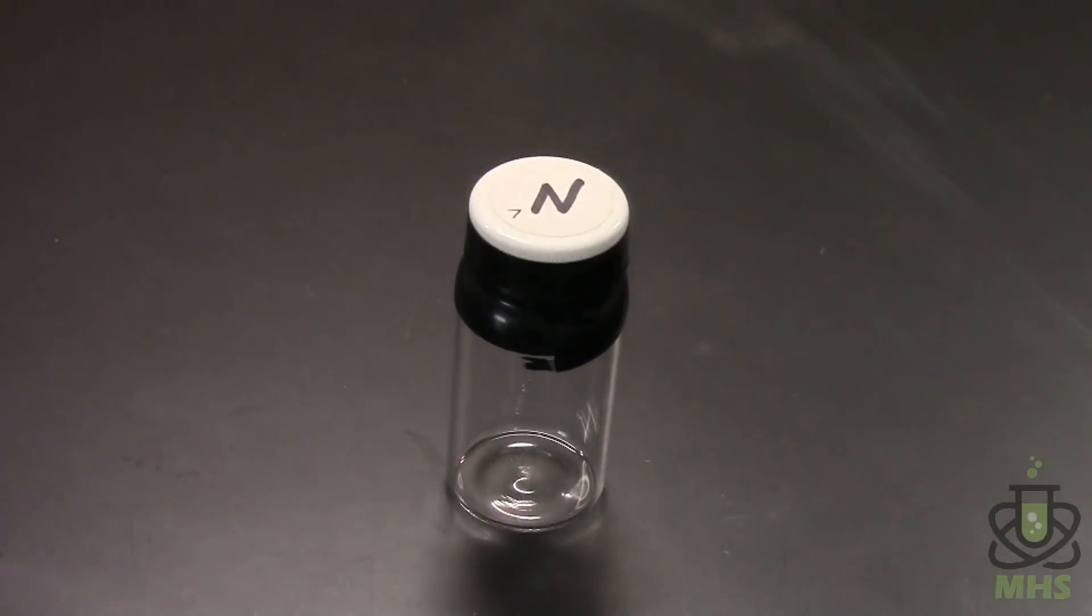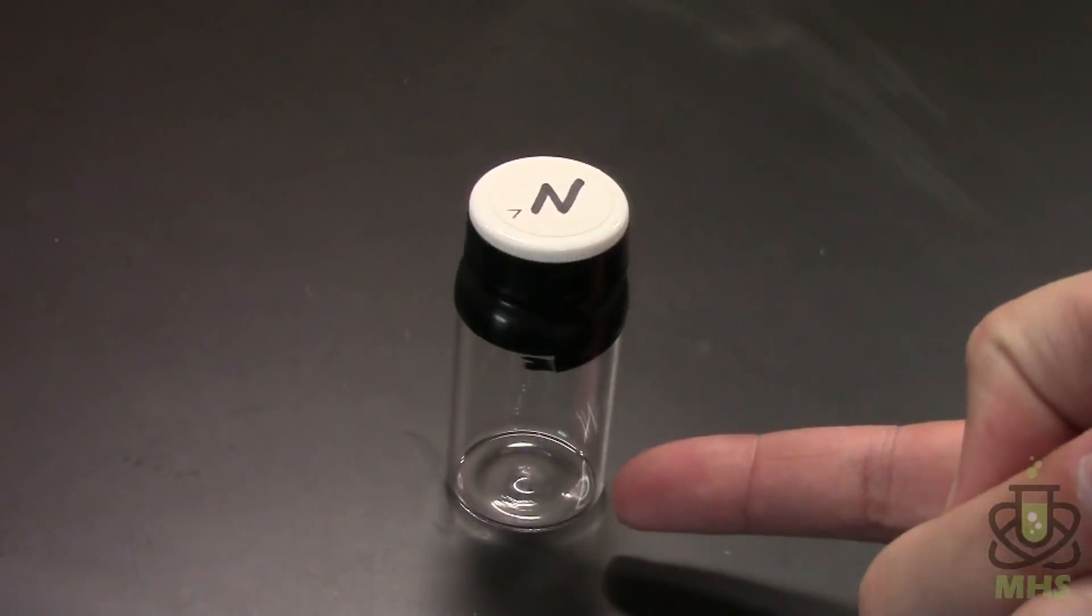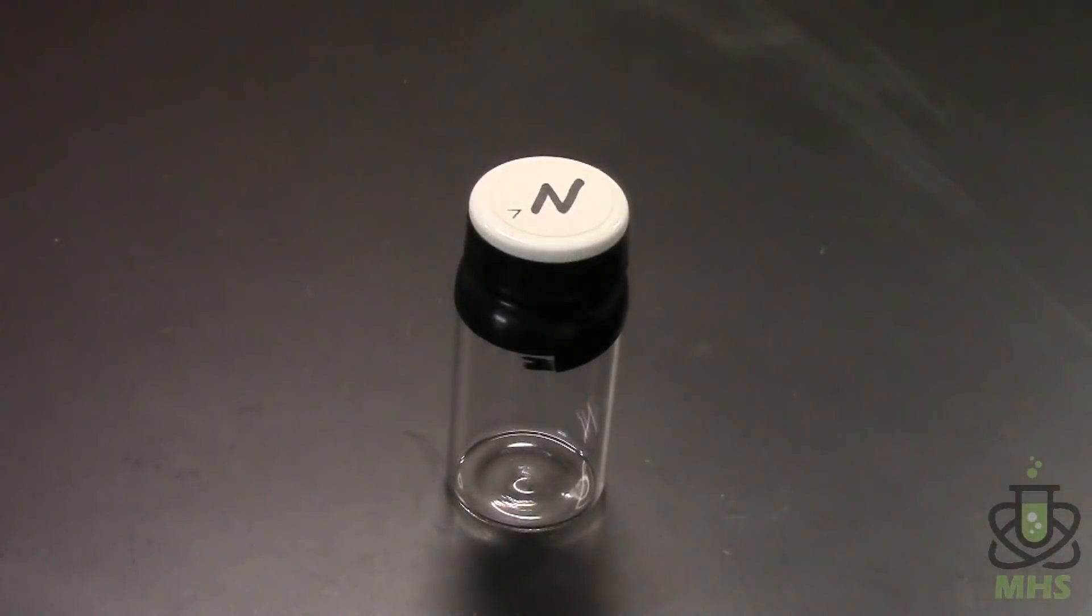Alright well this is my actual sample of nitrogen and it doesn't really look like much of course because it's clear and colorless but it is full of nitrogen and the way I made it was with liquid nitrogen. What I did was I filled this vial up with the liquid and allowed it to boil off so that displaced all the regular air and we're left with just nitrogen in there and so then I capped it and put some tape around it to seal it.